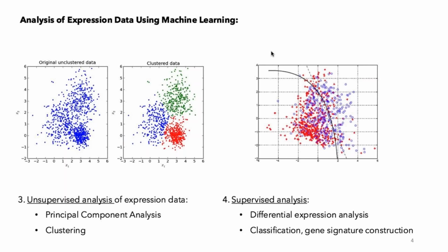Finally, we'll look at the annotation, where we can select a number of genes and convert them into gene IDs, so the simple name of the gene, as well as the gene ontology of that gene. And then we can use the differential gene expression output and map it onto pathways, seeing which genes are upregulated and downregulated on which pathways.